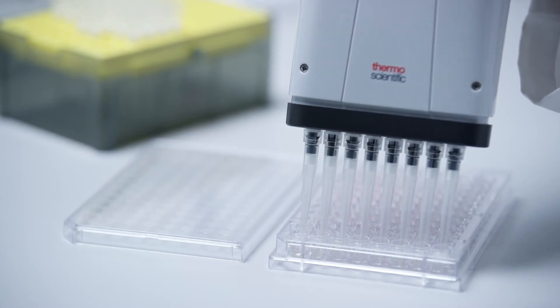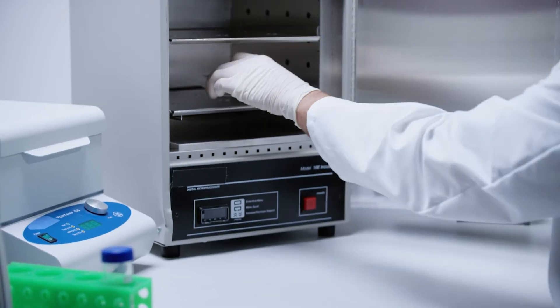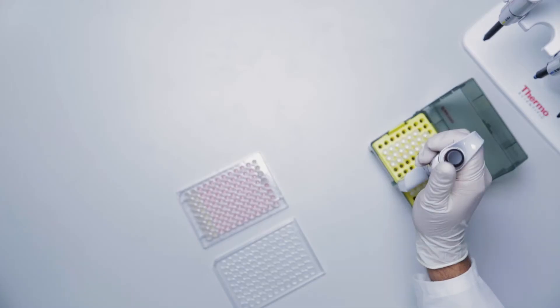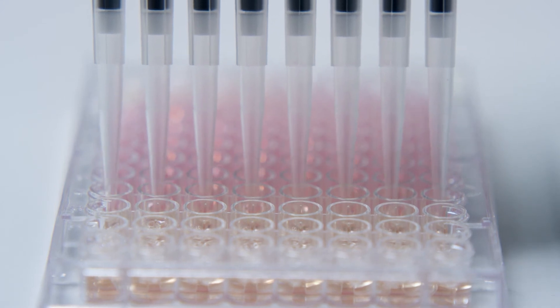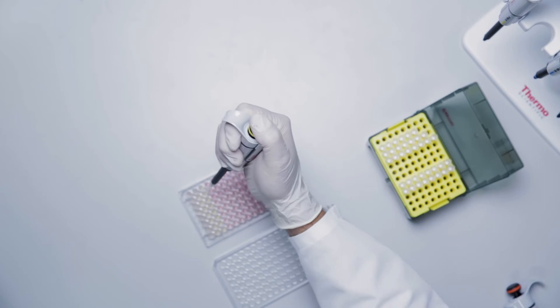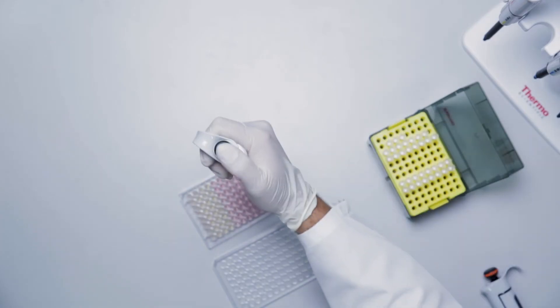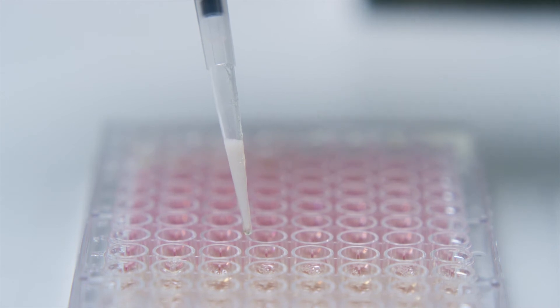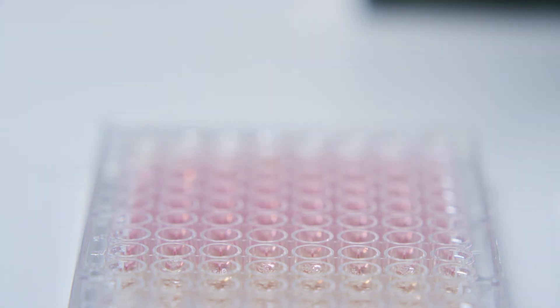Thoroughly mix the contents of each well by pipetting up and down 10 to 15 times. Avoid introducing bubbles and make sure to change tips. Cover the plate with a lid and incubate at 50 to 55 degrees Celsius for 30 minutes to lyse the cells. After incubation, mix the contents of each well by pipetting up and down 10 to 15 times, then examine cells under a microscope to ensure complete cell lysis. The cell lysate should be clear and non-viscous. High viscosity and incomplete lysis can cause poor assay performance, which can also be caused by the presence of unsheared genomic DNA. Additional pipetting, sonication, or freezing of the sample can aid in shearing the genomic DNA and reducing the viscosity of the sample.